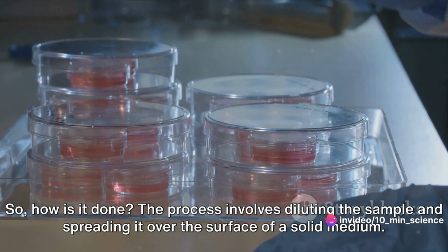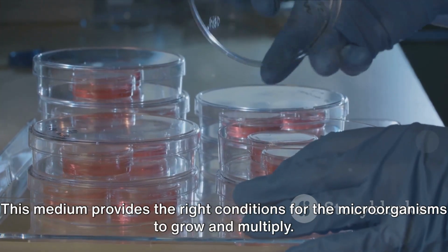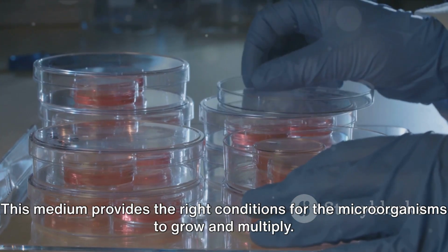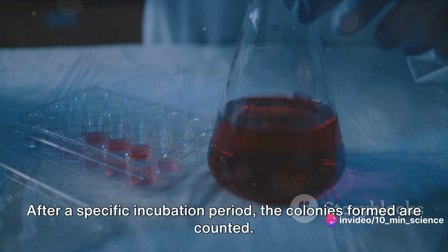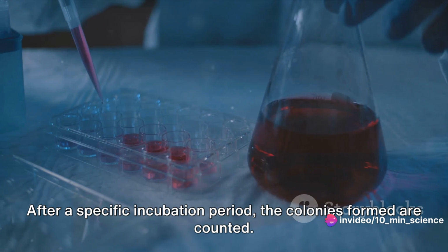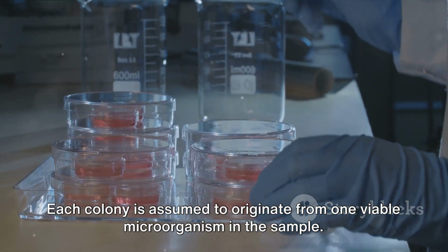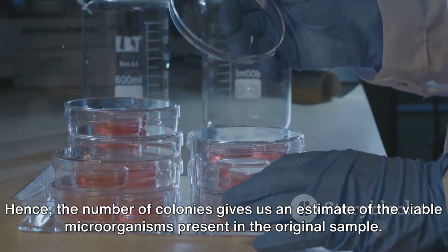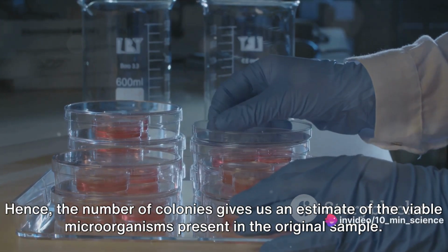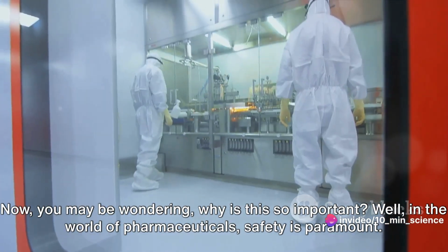The process involves diluting the sample and spreading it over the surface of a solid medium. This medium provides the right conditions for the microorganisms to grow and multiply. After a specific incubation period, the colonies formed are counted. Each colony is assumed to originate from one viable microorganism in the sample. Hence, the number of colonies gives us an estimate of the viable microorganisms present in the original sample.